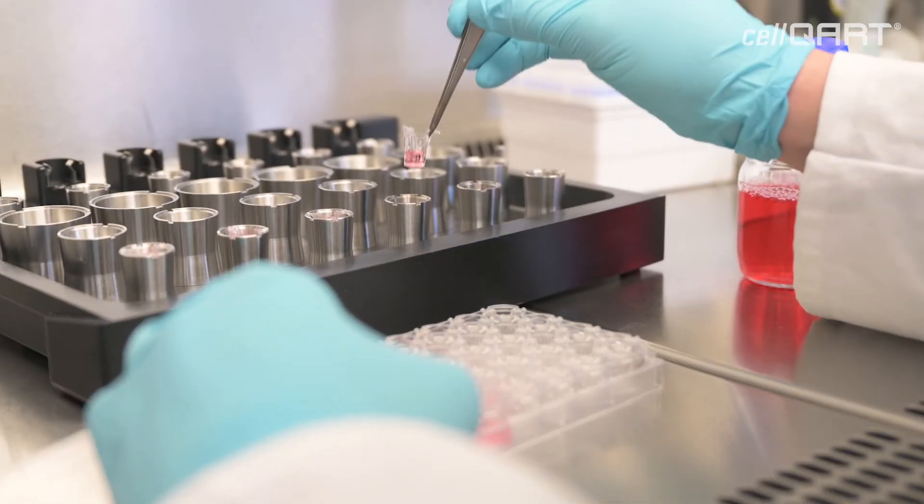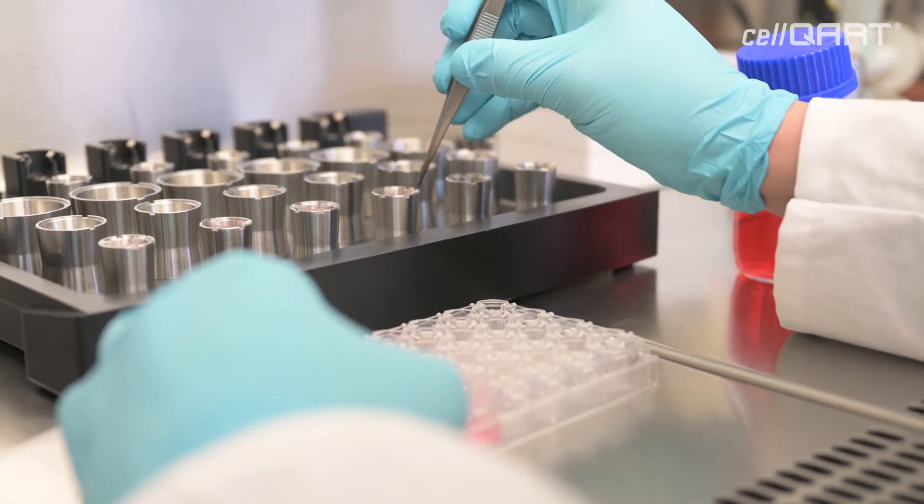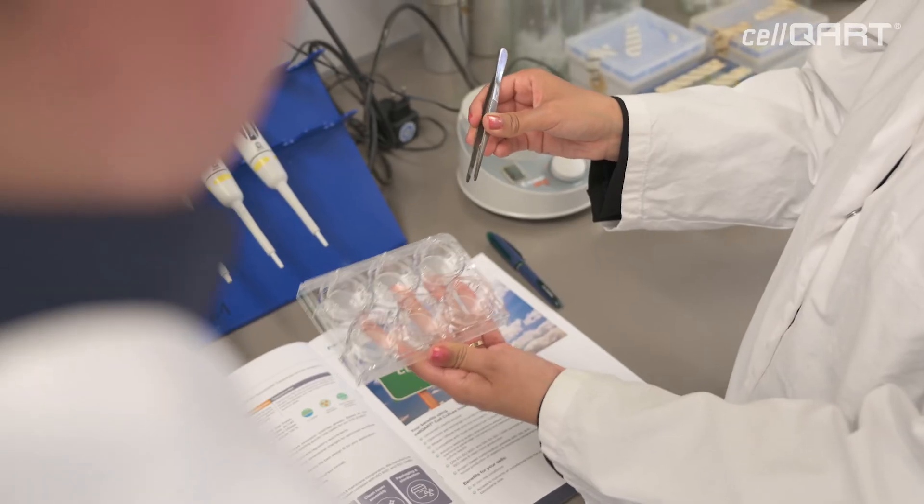The use of the cellQART line always delivers very reproducible and reliable results. The flexibility of the cellQART product gives us the possibility to use them in a lot of different assay types, and all of this while they are still extremely easy and robust to handle. This is exactly what we need for our work here and which is very beneficial for us.